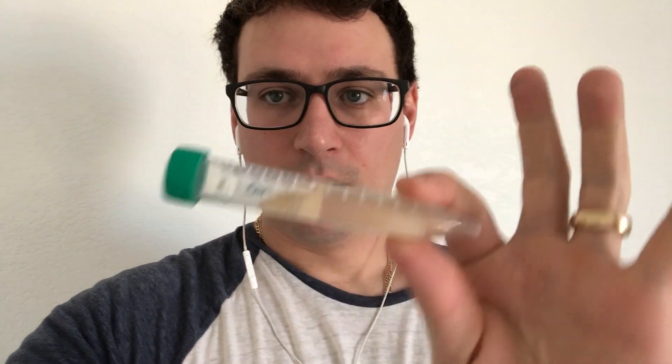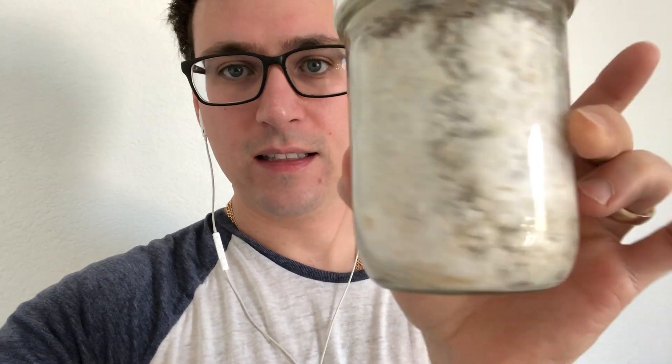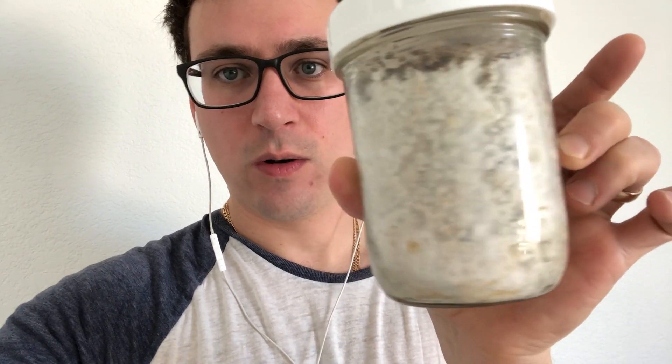Another common substrate is brown rice or brown rice flour — you can also use grains. Right here I have my own mix using perlite with brown rice as a nutrient. I'm going to be using that same 1-to-10 dilution of the chestnuts. I actually started running some of the chestnut — the Pholiota adiposa — on this substrate and it seems to be taking off quite nicely.